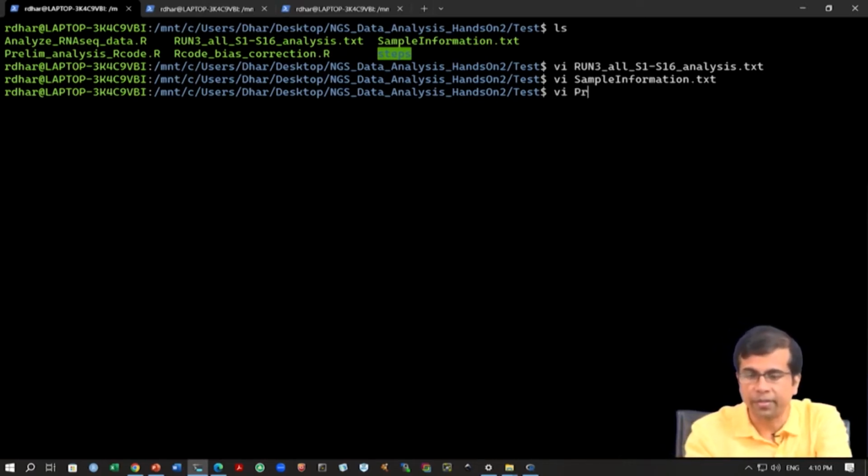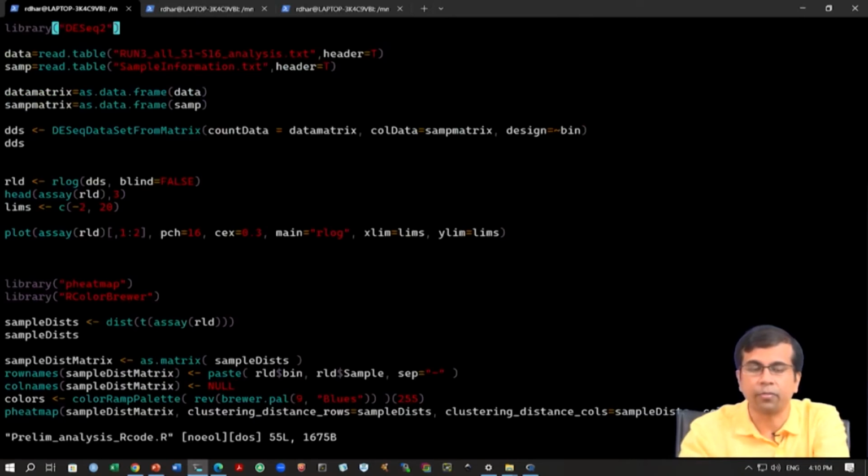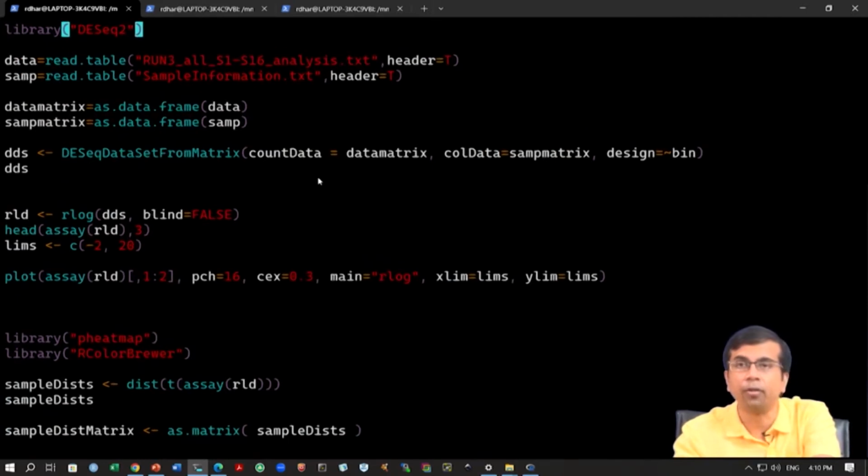So, to see this I will just simply run this. Of course, we can run this R code as a script, which I want to, because I want to explain all the steps that we are going through. So, do not pay attention to everything that is there, I will go one by one.